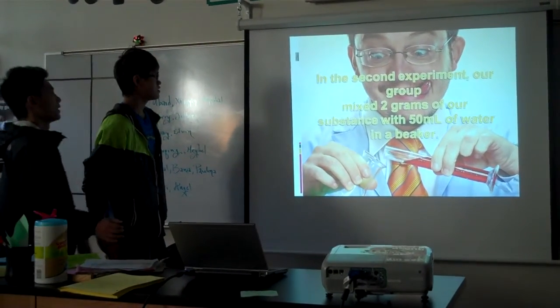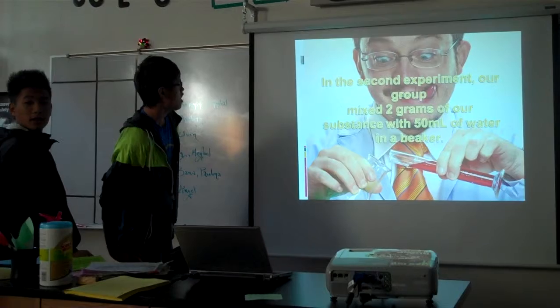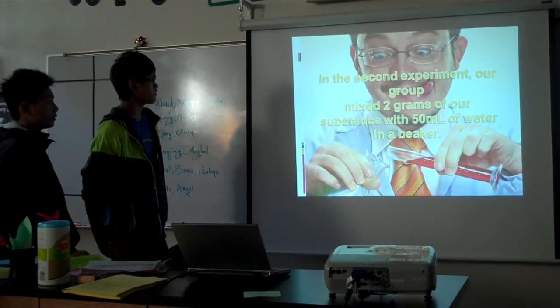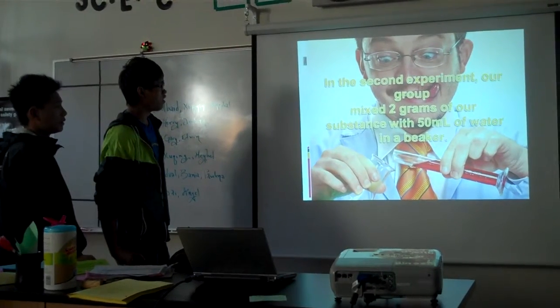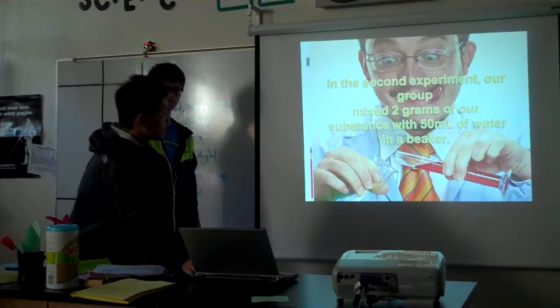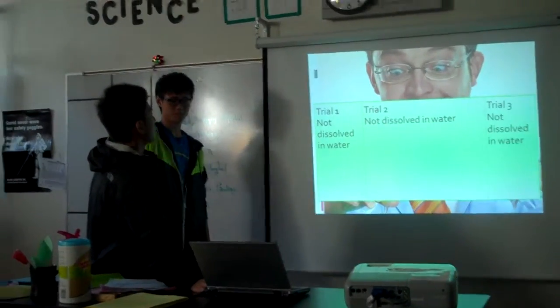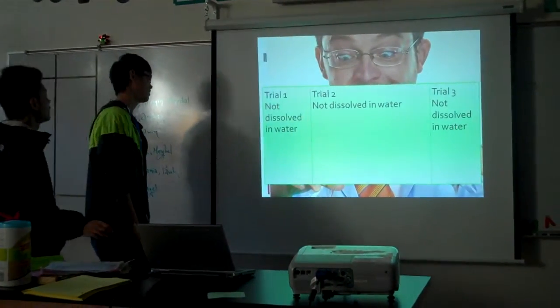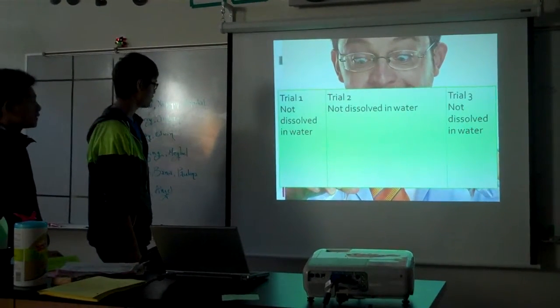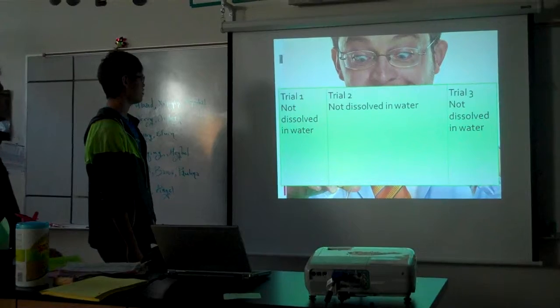In the second experiment, our group mixed 2 grams of our substance with 50 ml of water in the beaker. In trial 1, it did not dissolve in water.